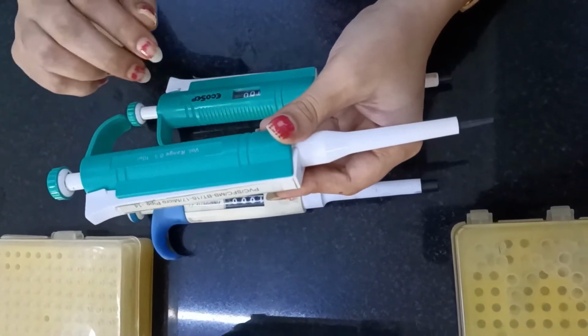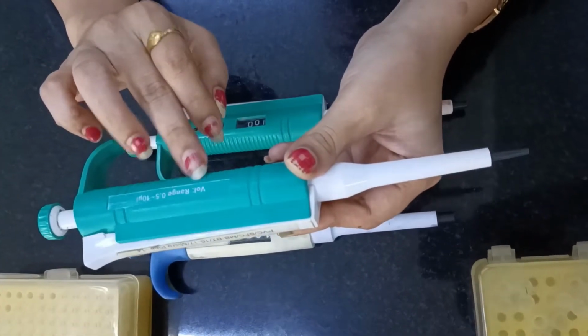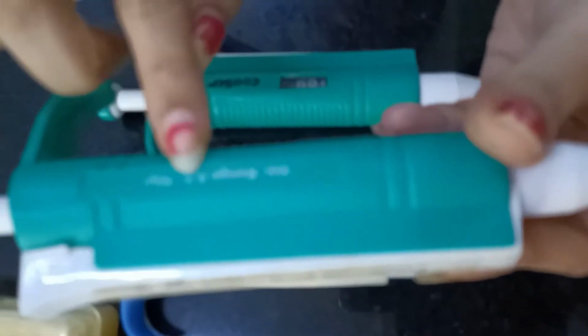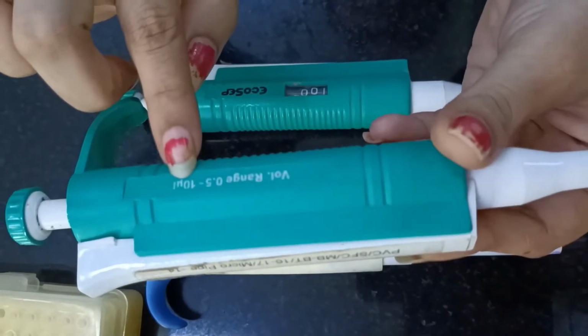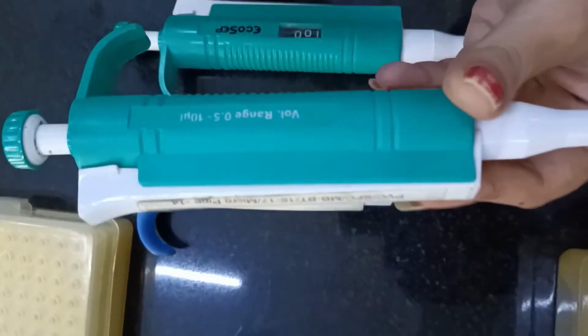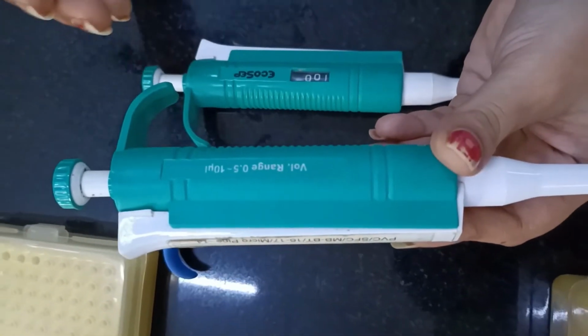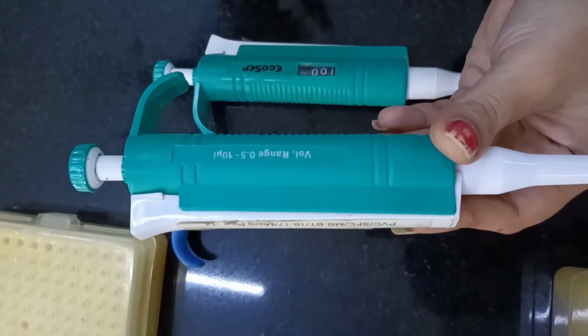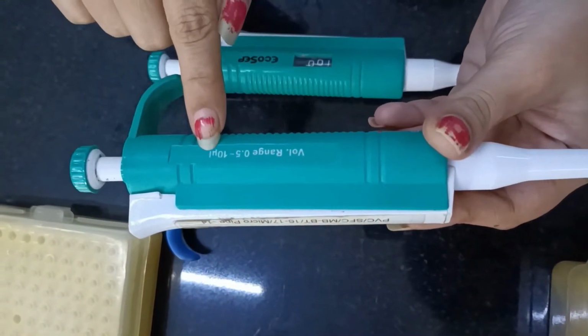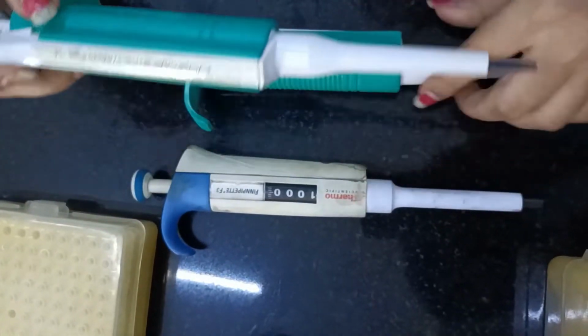With respect to this particular micropipette, as you can see over here, the range of how much volume it can take in is from 0.5 to 10. So beyond 10 microliter, it cannot take up the volume, or below 0.5 microliter, it cannot take up the volume. You can selectively take up the volume within 0.5 to 10 microliter only.